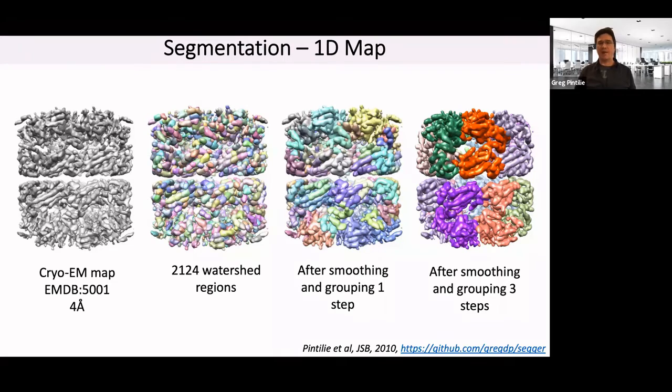In a lot of cases, this tends to happen, not in every case. In some cases, the regions might be joined so as to join regions from different proteins. But generally, what this process does is, as you're smoothing the map, the more globular things will tend to be grouped together. In this complex, each protein is somewhat globular. It has these two parts, but as the smoothing goes, you can think of a peak being assigned to each protein. So it works well in this case.